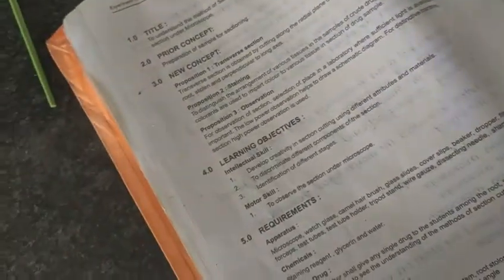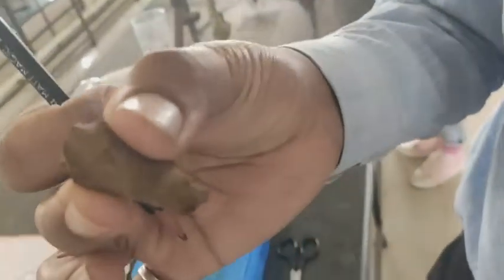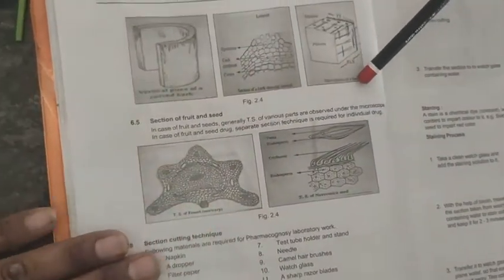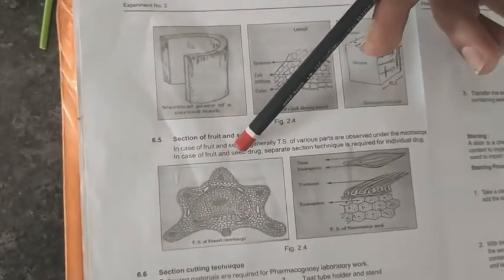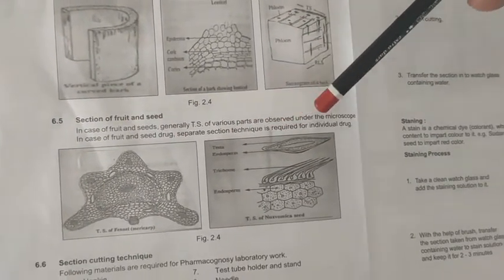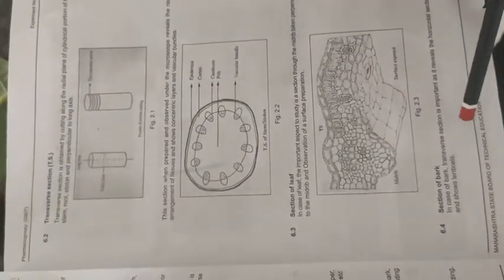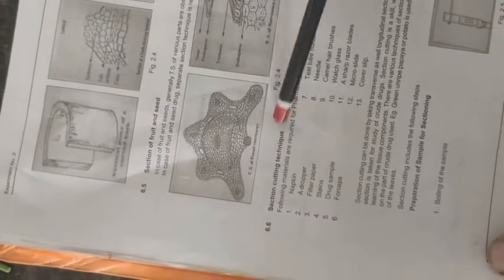Then next is your section of the bark. This reveals horizontal cells and the radial arrangement. Then next is your section of the fruits and the seeds. This is generally done by TS, and the various parts are observed under the microscope. In the case of fruits and seeds, a separate section technique is required for each individual drug. This is about the different parts of the drug, that is your root, then your leaf, then your bark, then your fruits and seeds. We have to use a different section cutting technique for each.